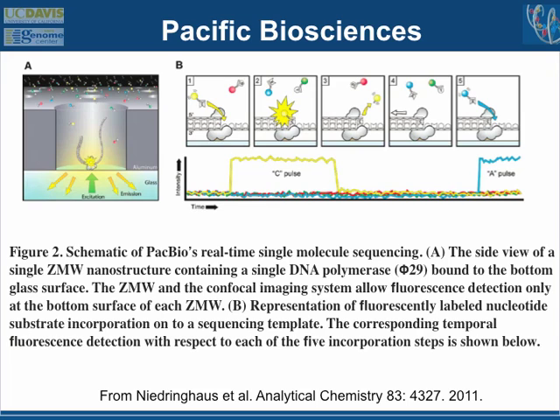And if you can prep the library, you can literally get data in 15 minutes. If you can figure out how to analyze it, you could run a new reaction based upon the initial result and in essence do real-time experimental studies where your results change what you're going to do with the sequencing an hour later. It is completely amazing. We have one at UC Davis. It's not been used in a lot of studies effectively yet, again, because the error rate is so poor. But it's still really cool.